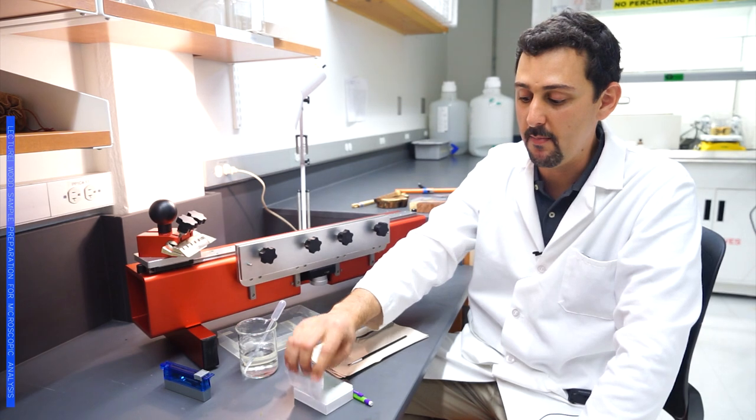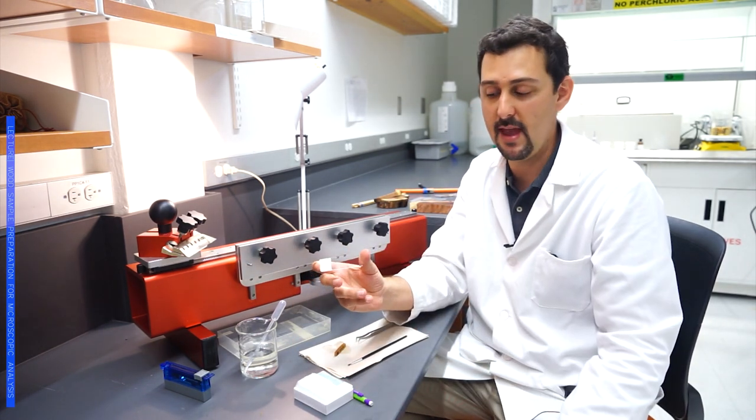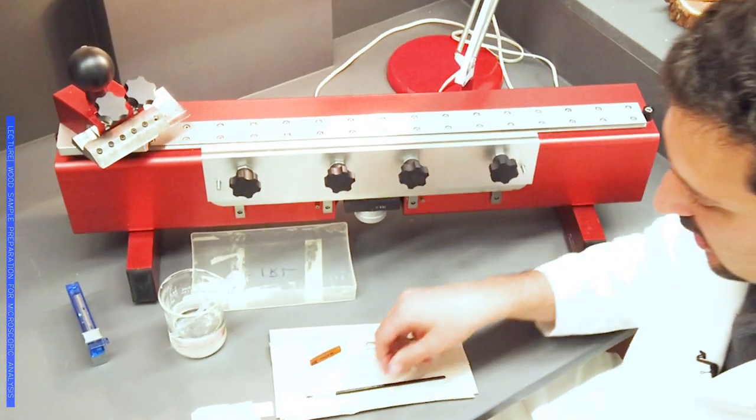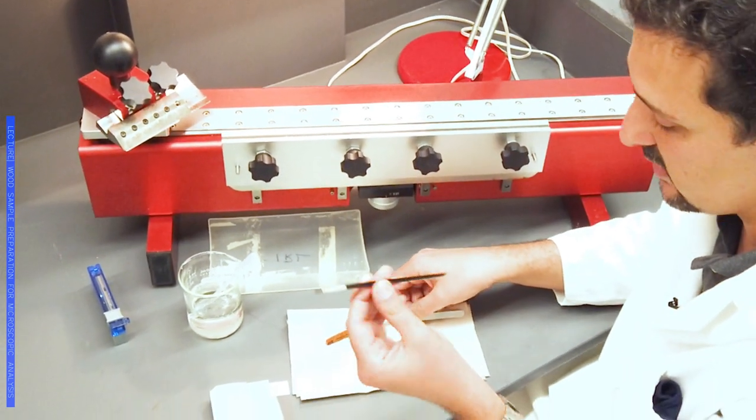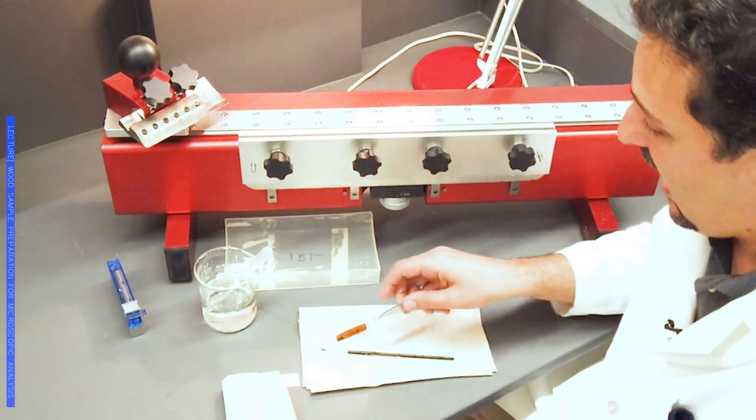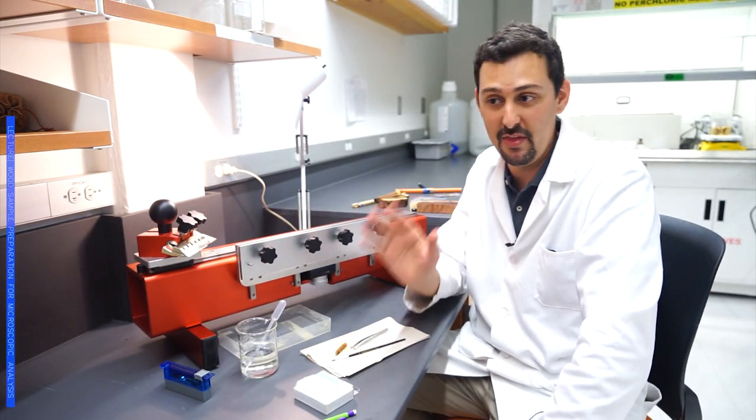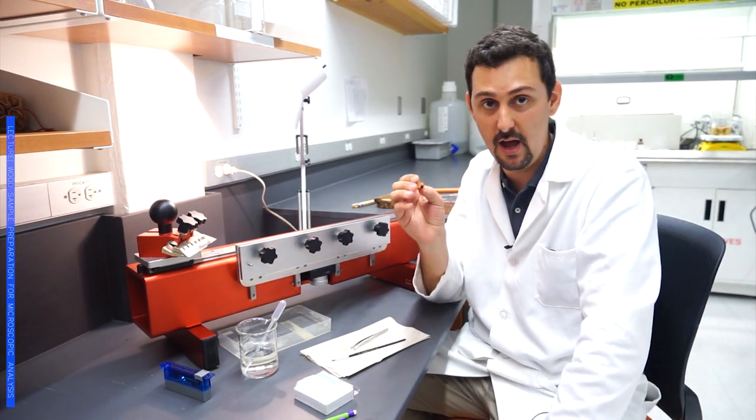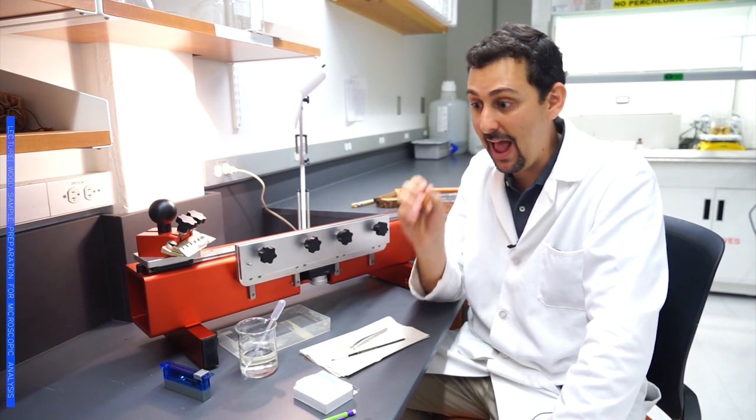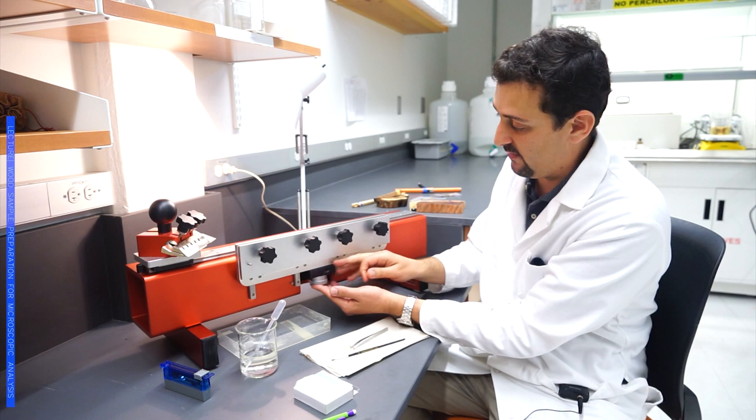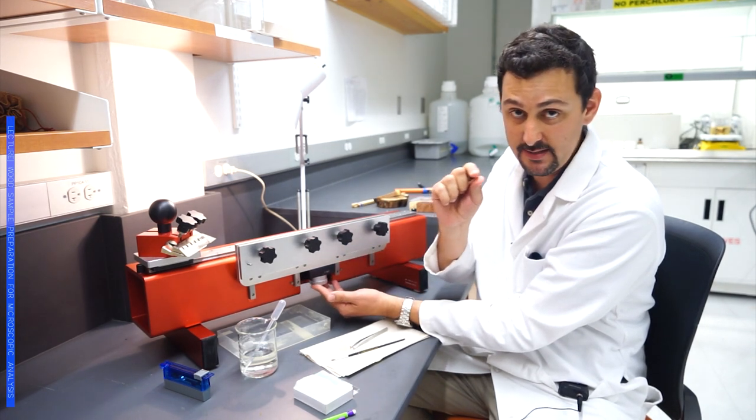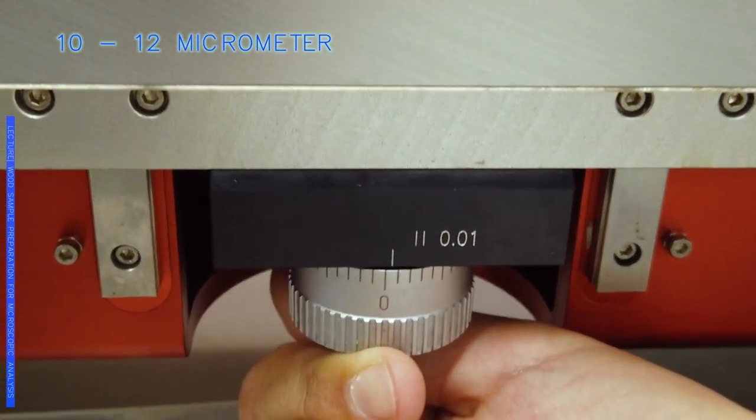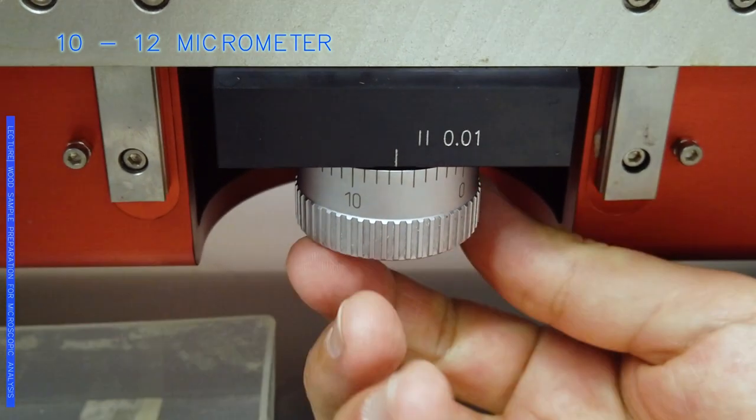The samples, we will put them on a glass slide like this one, where we will also write the name or code of our sample. We will help ourselves cutting with a little paintbrush like this one, and also a couple of tweezers. With that, and with a lot of practice and a little bit of talent, we will be able to get very thin cuts from this wood. Normally we will be cutting the wood from 10 to 12 micrometers. That's the thickness that we will need for this type of preparation.